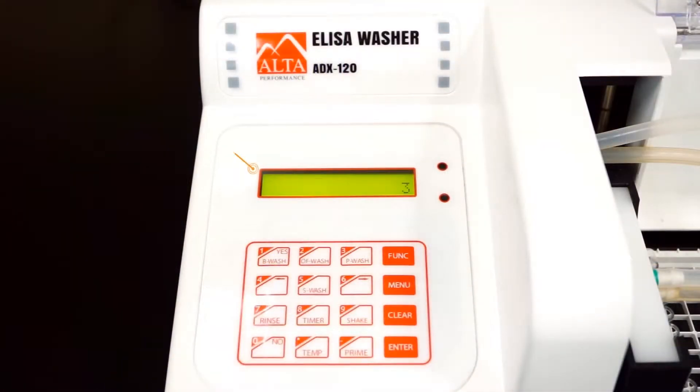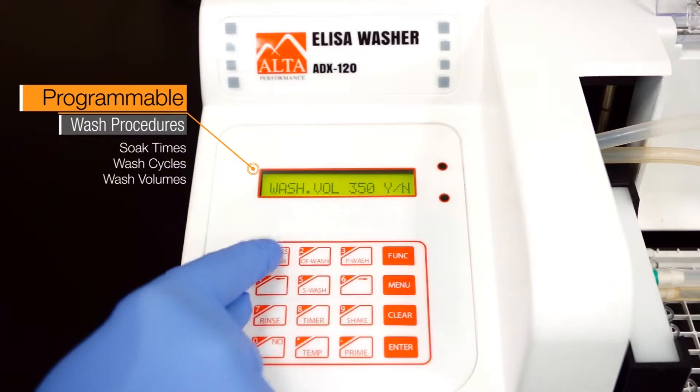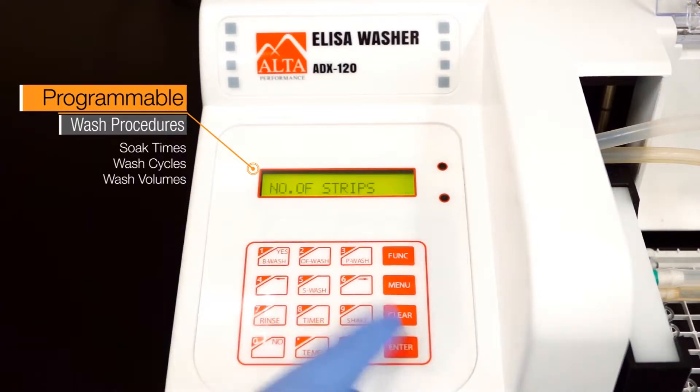Dispensing and aspirating routines, soak times, wash cycles, and wash volumes can all be easily set through the washer's intuitive software. The menu-driven interface makes creating custom protocols and multi-step programs on the Alta Microplate Washer quick and simple.